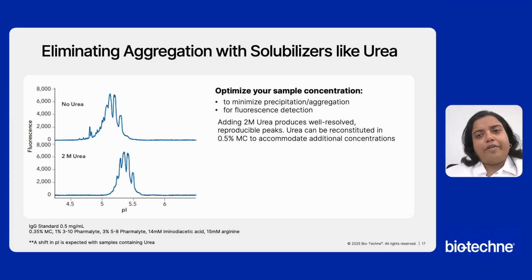Proteins do tend to aggregate. Some molecules may show evidence of precipitation or aggregation during the focusing step of MauriceFlex batches due to the higher sample concentration typically used compared to your Maurice icIEF batches. If you have sufficient peak intensity but observe an unexpected peak profile, say aggregation spikes, you can either reduce the sample concentration or add protein solubilizers to the sample.